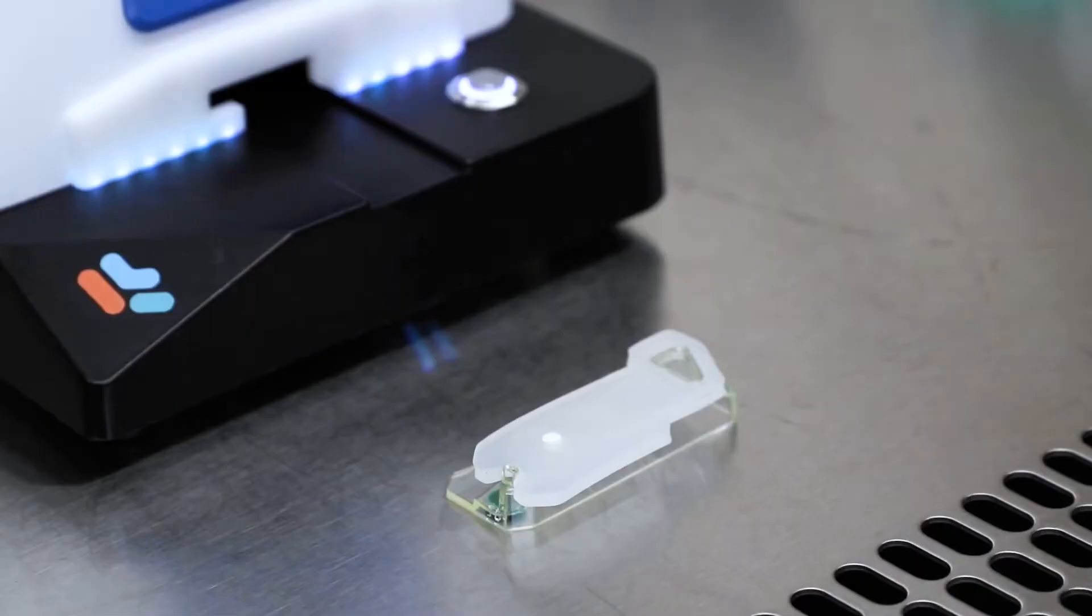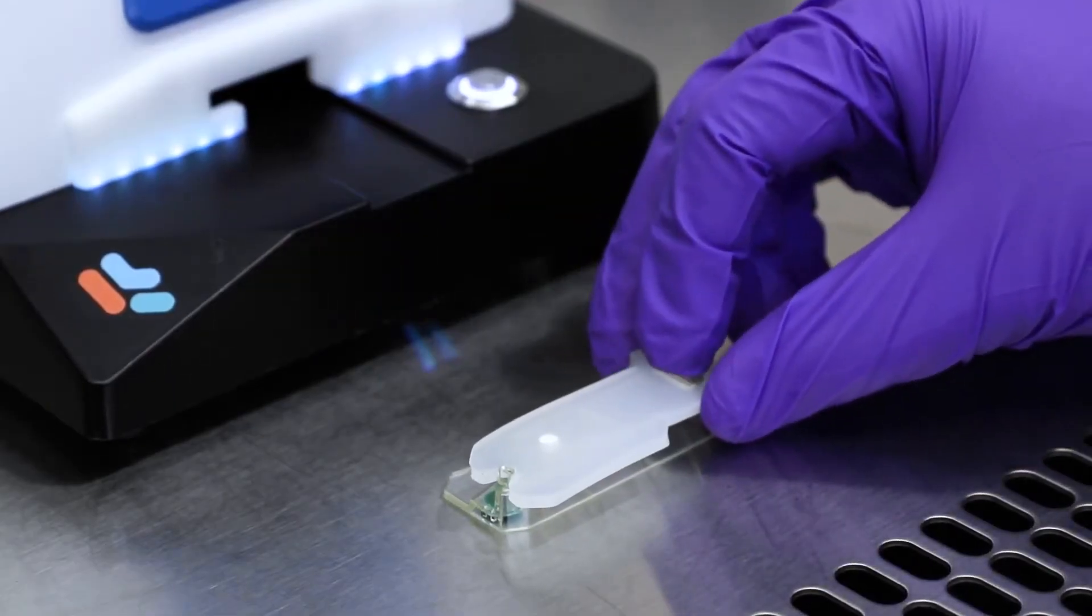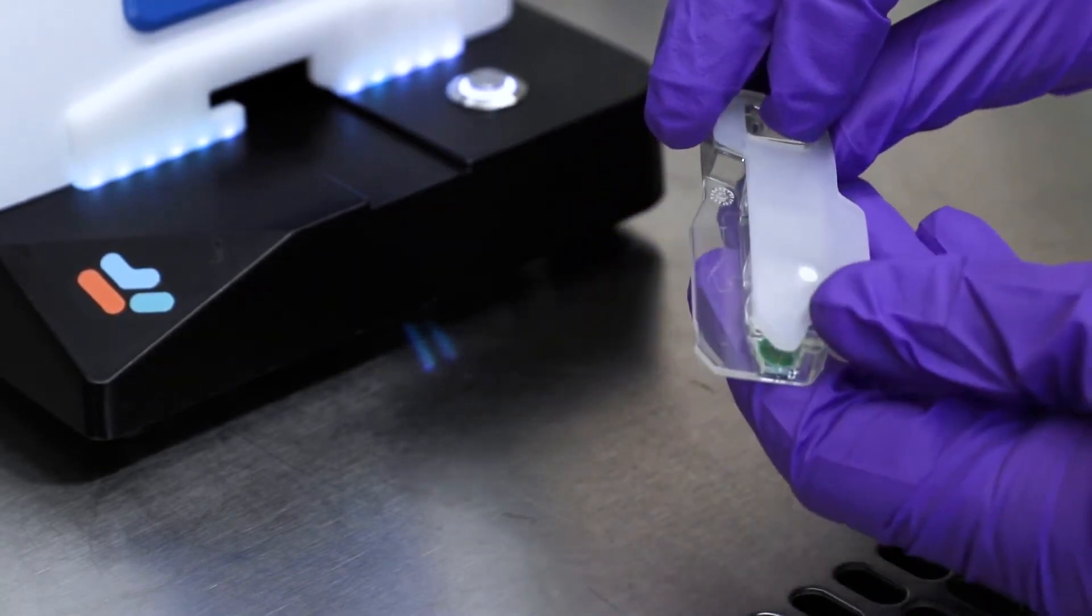Like all NanoAssembler instruments, the Spark uses proprietary next-gen microfluidic technology for controlled and reproducible manufacturing of LNPs.